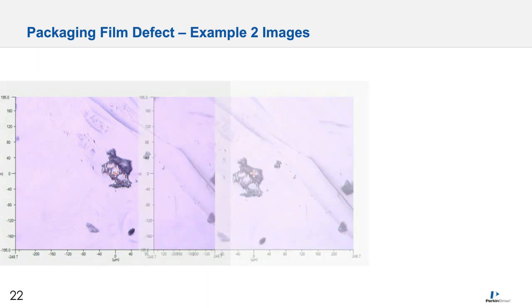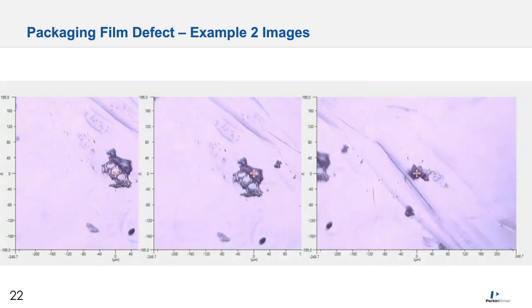So in this measurement, we perform infrared analyses of multiple positions with multiple pieces of debris. In each of these images, we'll see a red crosshair at the center. This marks the center of the image and the center of the infrared aperture position. Also, you may be able to see a dotted line box centered around that crosshair. This shows the dimensions and rotation of the apertures. So here we have three particles or three regions of interest which were tested with the Spotlight 200.